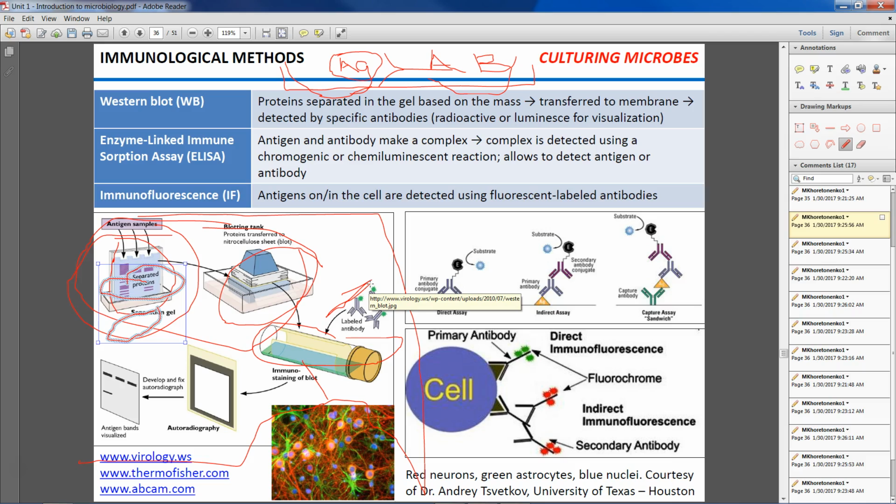You add antibodies, and antibodies will attach to the proteins on the membrane. And then you add a special reagent that allows you to detect the antibody-antigen complex. So only parts of the gel where you have the protein you are looking for will, say, light up. Does that make sense? Antibodies will bind to a very specific protein. That very specific protein is located in a very specific part of the gel, right? You have a signal, you have a band.